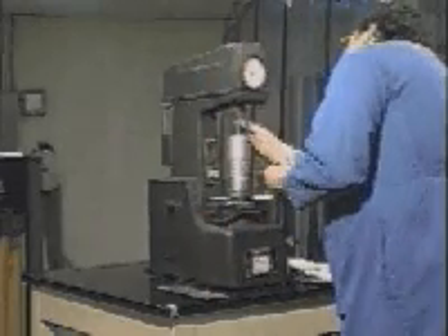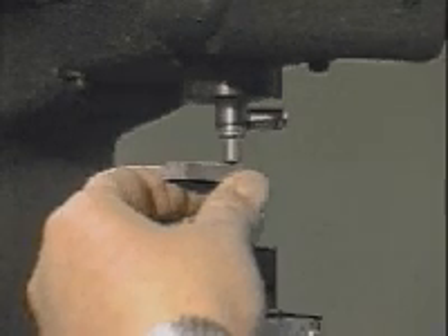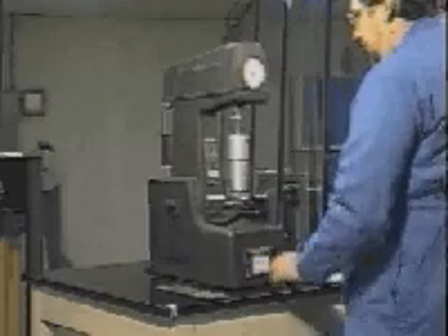Raise the pedestal under the specimen until contact is made with the indenter and the minor load is applied. Zero the scale on the dial indicator if required. Release the control to apply the major load.